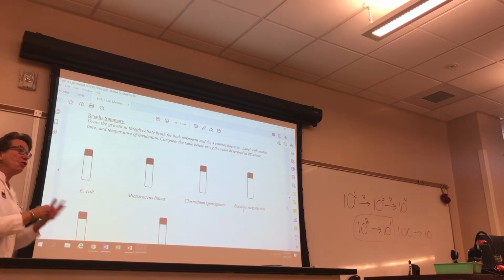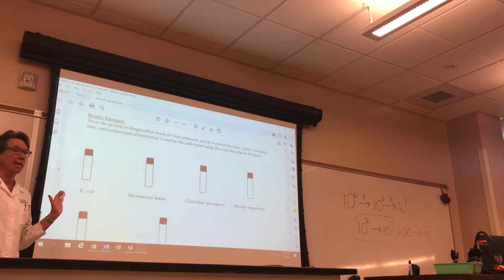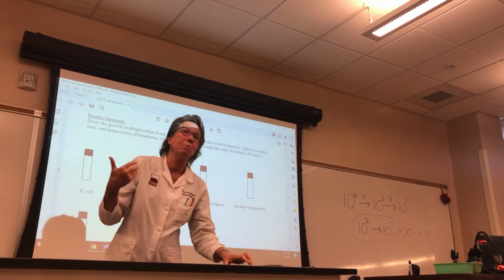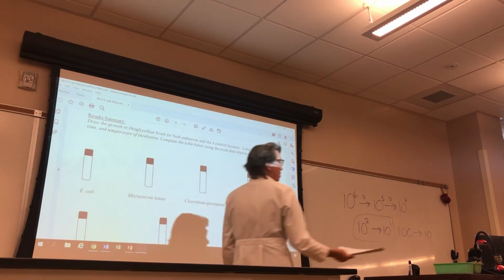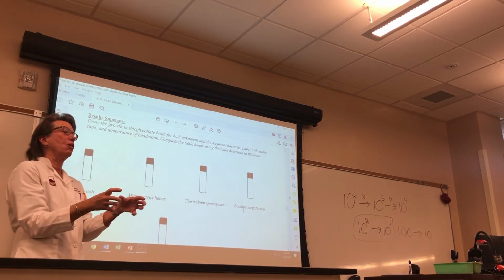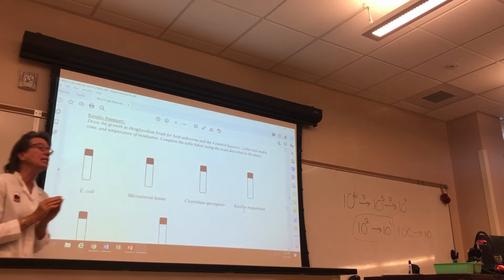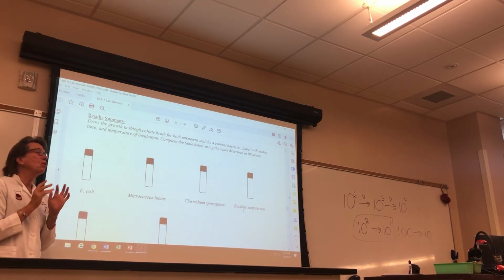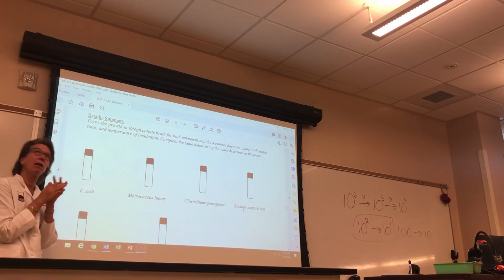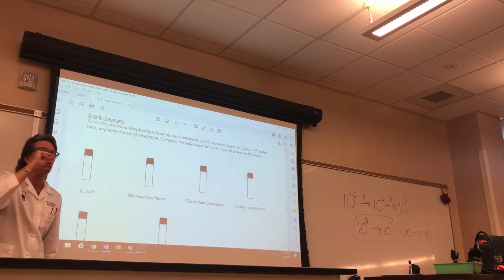So if you take your tubes out and you bounce them around and knock them around, you're not going to see the pattern. So you literally want to be kind of careful. And I'll bring them out here and try not to trip when I'm carrying the tray out. I'll try to be careful. But again, just don't shake those. So you want to look and see where you see growth and indicate that growth. I suggest, guys, don't use a yellow or white colored pencil. Use something darker so you can actually see where the growth is.